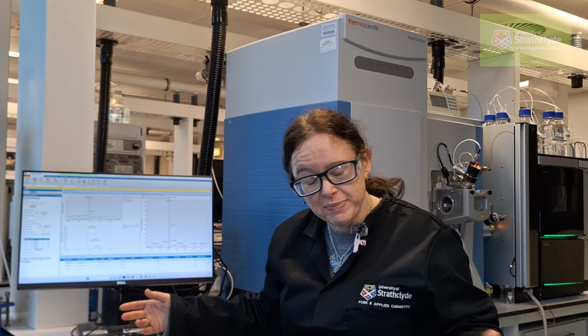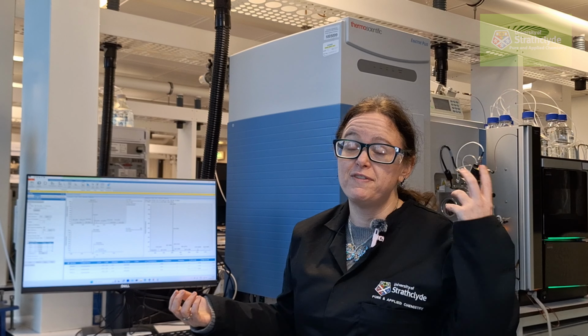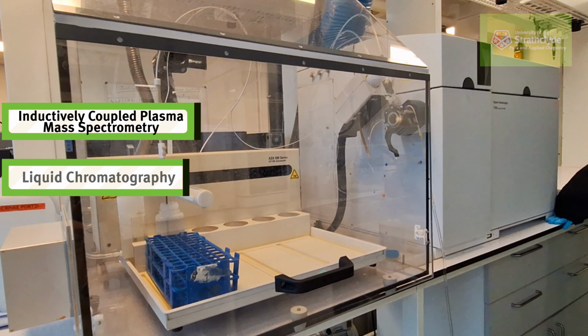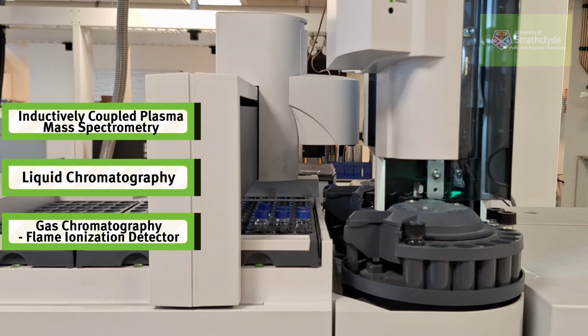This is Dr. Jessica Bame, and along with my colleague, Dr. Graham Anderson, we run the Mass Spectrometry facility. Welcome. Here we can analyze mass spectrometry of multiple different sample types, from the elemental to very large macromolecules: ICP-MS, low resolution, LC-MS, GC-MS, GC-FID, as well as those who are interested in our high resolution systems.